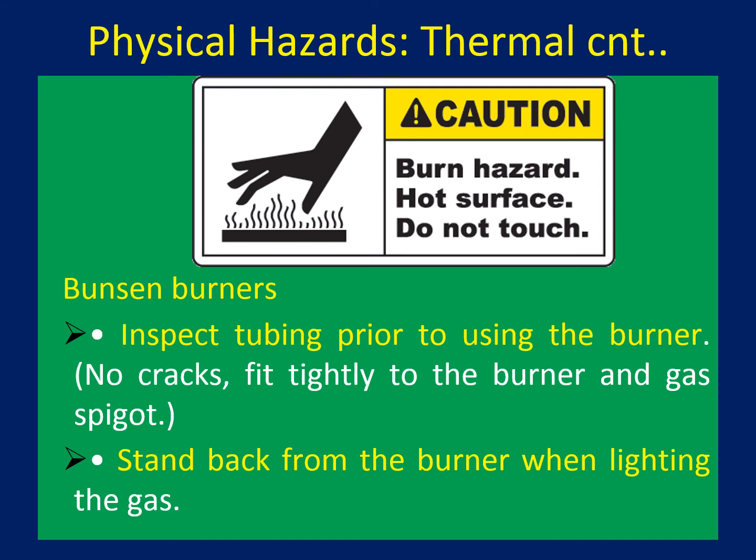And I think most of them have seen these kind of symbols, burn hazard. If you have a hot surface, it means you don't need to touch these surfaces because they are always hot. So you may have seen those symbols on our hot plates, and you can be very careful about handling those items. You have to wear gloves, thermal hazard gloves.